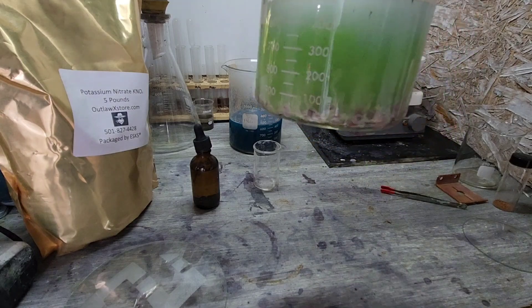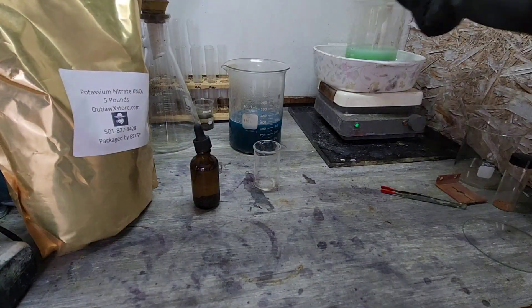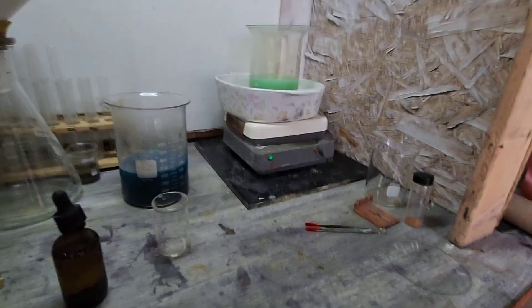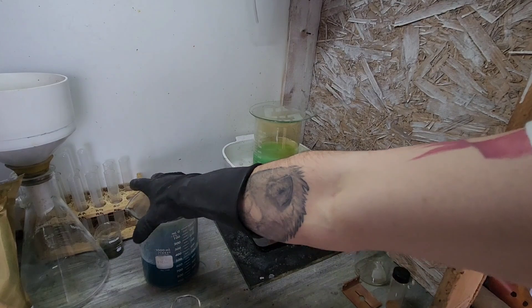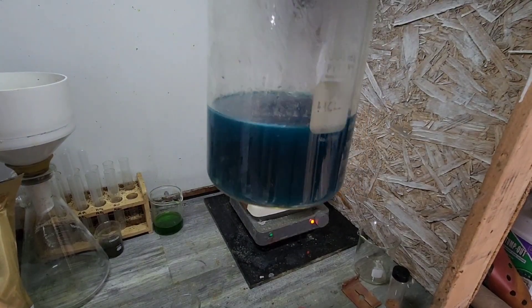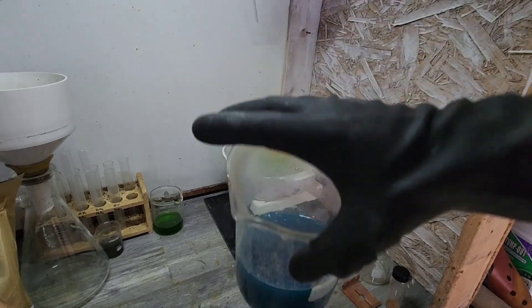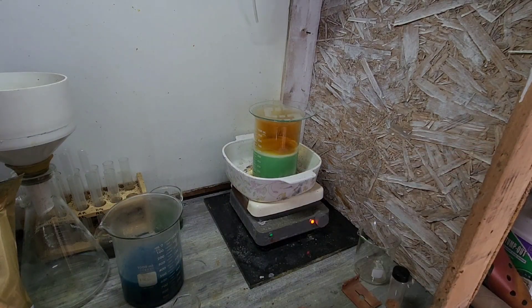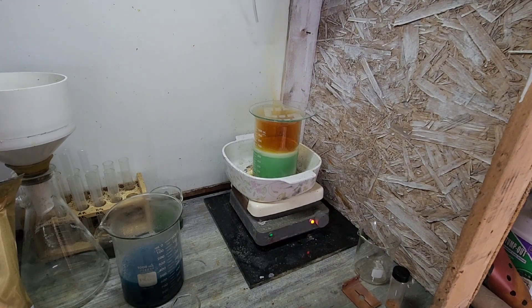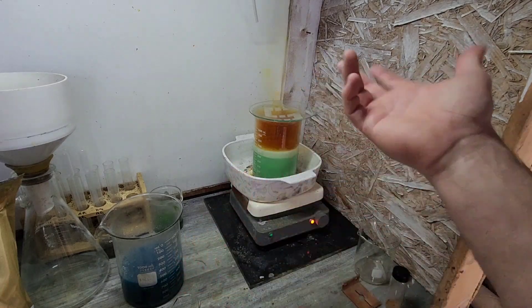Oh yeah, look at that — the reaction happens almost immediately. I think what I'm going to do this next go-around is continue putting potassium nitrate in. I feel like we could probably shove a little bit more in there. That looks pretty saturated, there's no question about that. See how much metals we can shove in that solution — it's less material to deal with and a little cost saving.